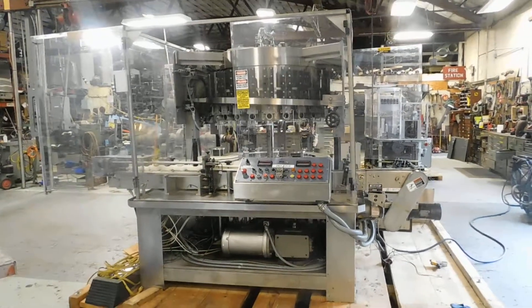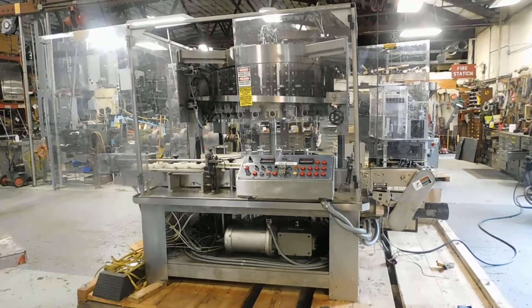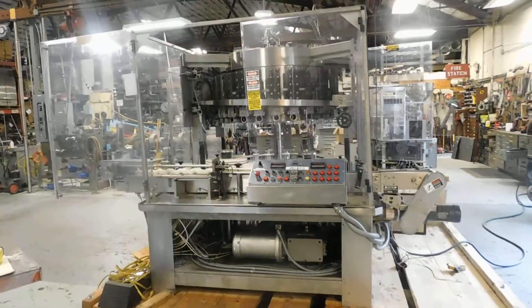Hi, welcome to Champion Trading. What we're demonstrating for you today is an MRM Rotary Piston Filler. It is a 24-head machine. The factory says it's capable of up to 300 bottles a minute.